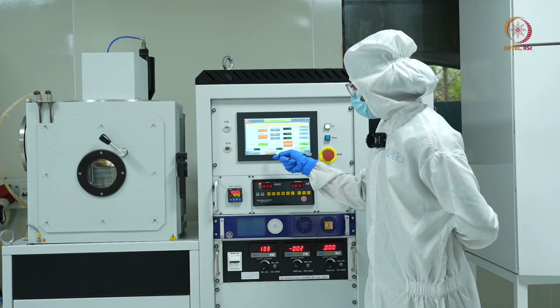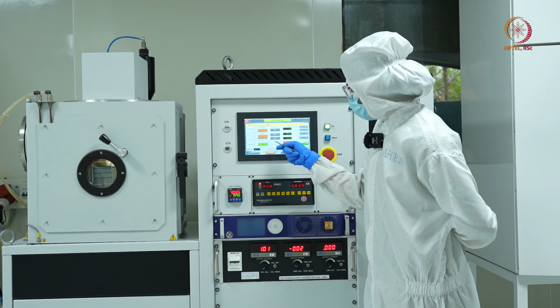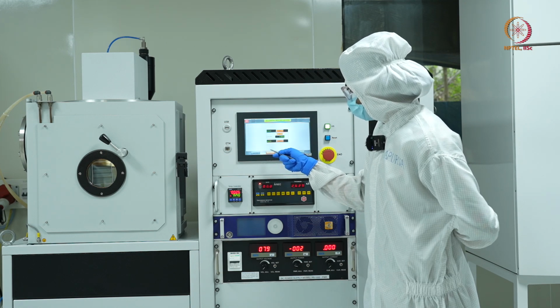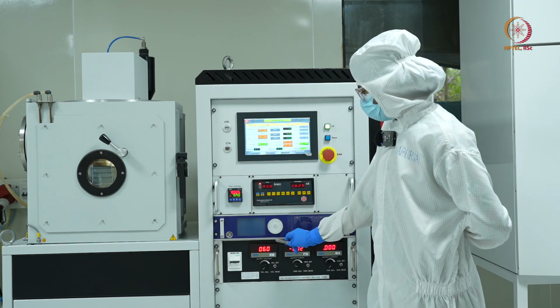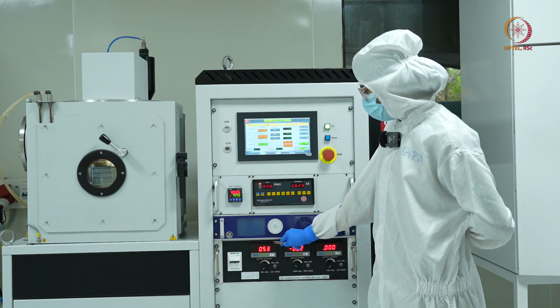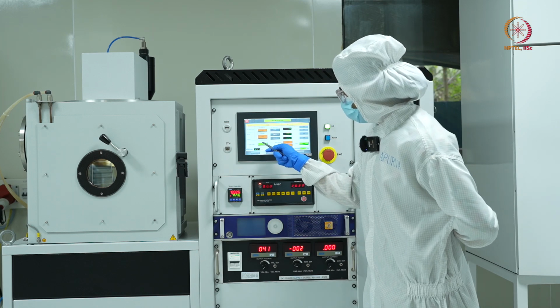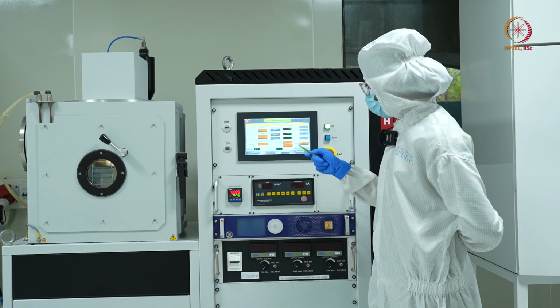Meanwhile, I will stop the rotation. Once my read voltage is below 50, I can switch off the DC supply and the DTM as well.